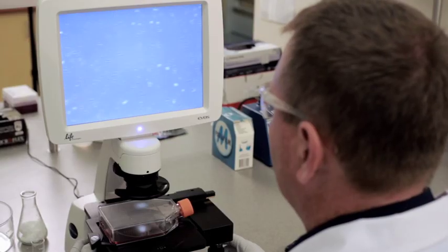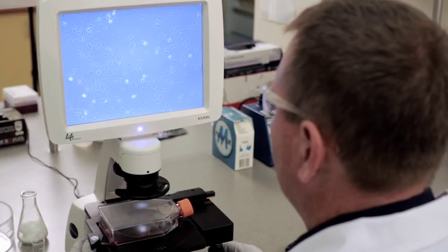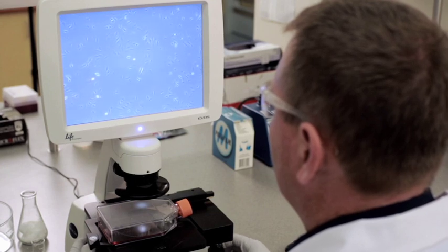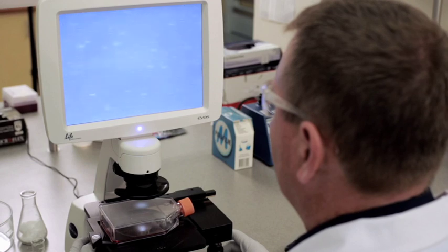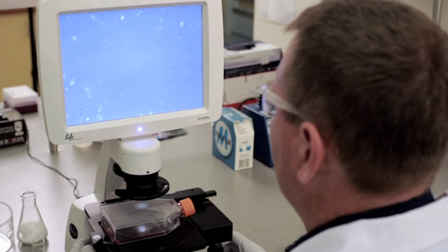Two viewing modes have been created to give the option of quick scanning or viewing your sample at a higher resolution. The fast mode displays the image at a lower resolution but in real time, perfect for quickly scanning the plate.